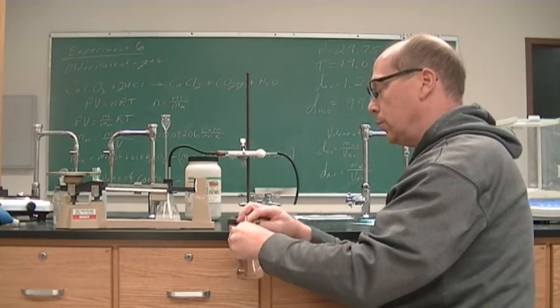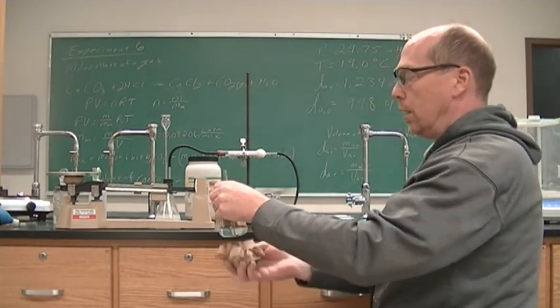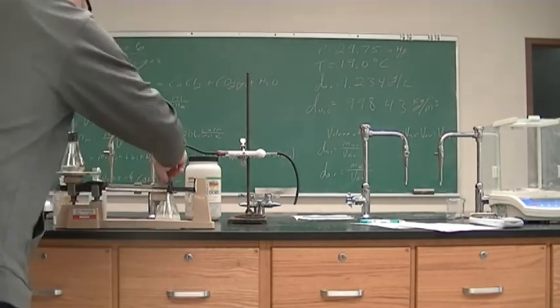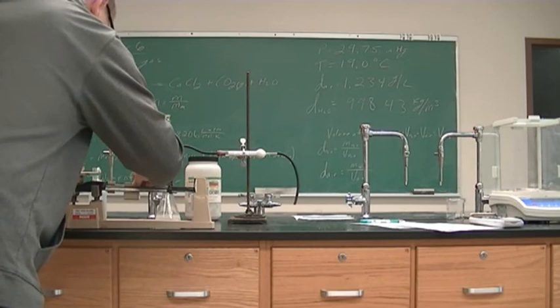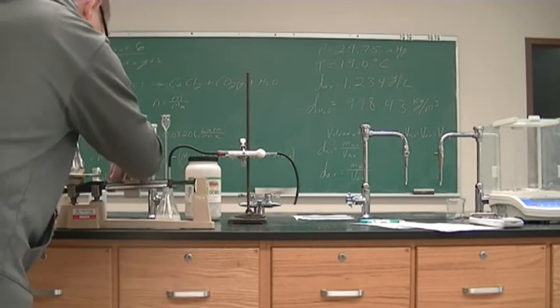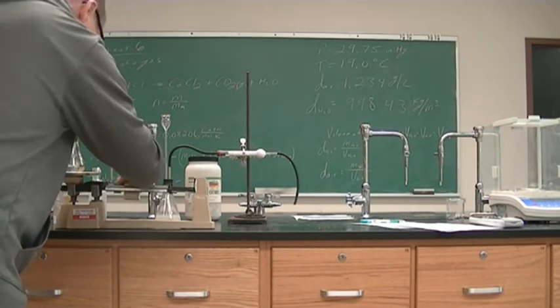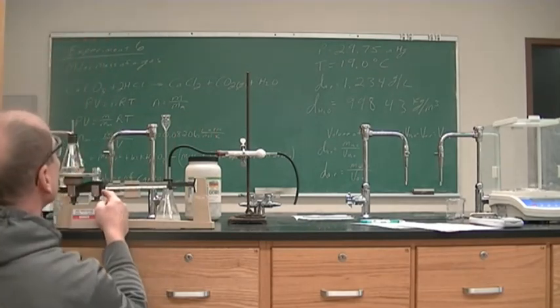All right, so now that I have wiped off the side, we're ready to get the mass filled with water. All right, so let's zero it. 200 plus 2. All right, 210.